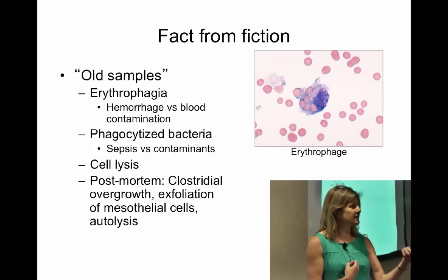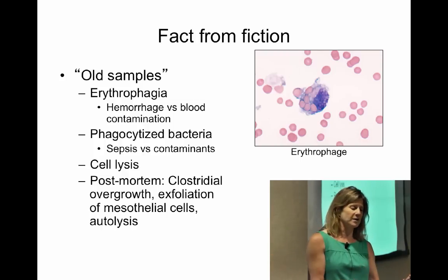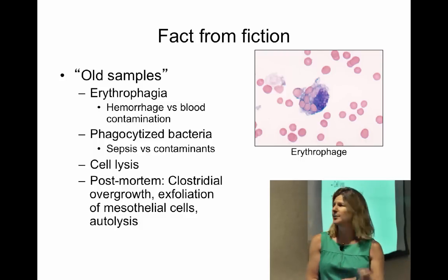You give us slides and they're good quality and we can examine them and we have enough cells to look at, and we don't see erythrophagia, we're going to default to it being an in vitro artifact. So that's where your slides help us.